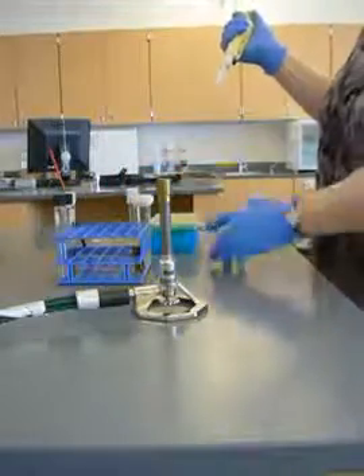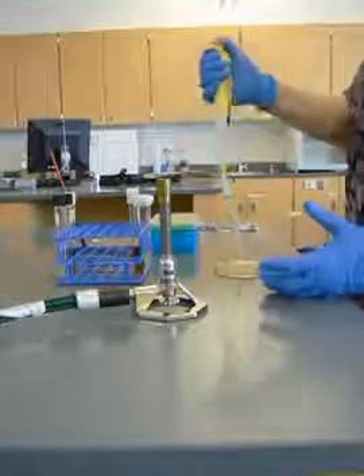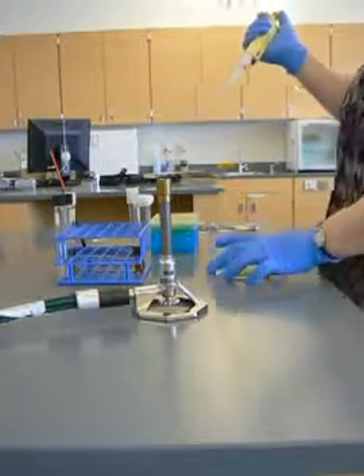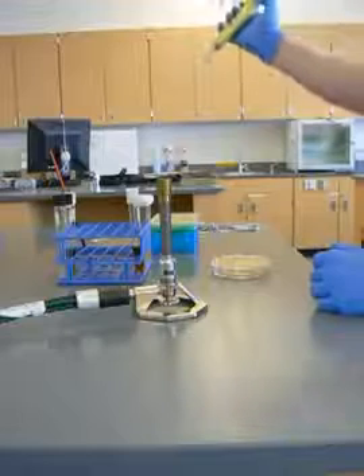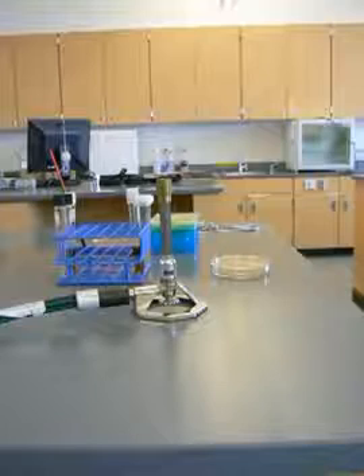Now I'm going to flip my plate over, open up the lid, and dispense that. Off to the side here, I have a container where I'm going to dispense my tip so that it doesn't stick.